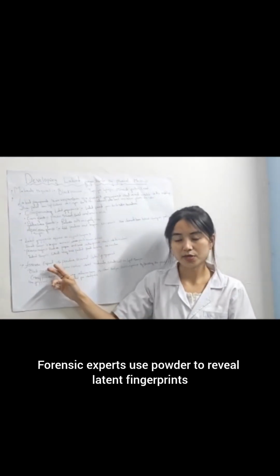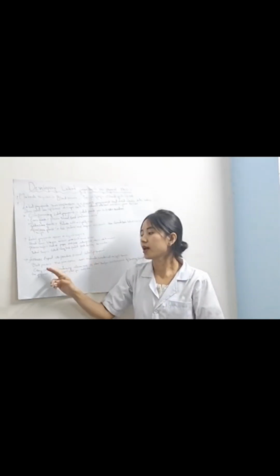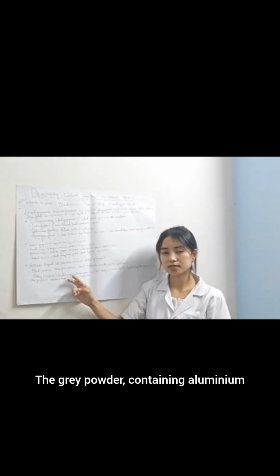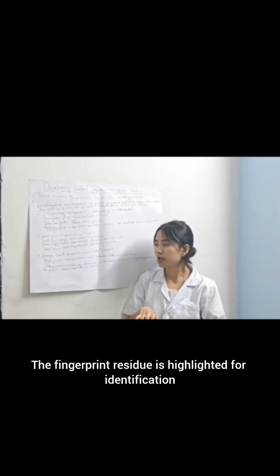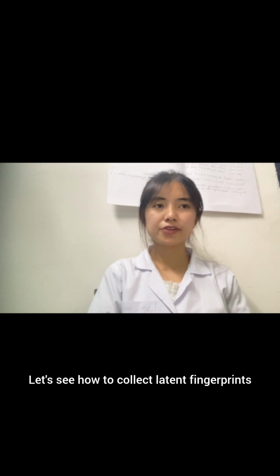And forensic experts use powder to reveal latent fingerprints. Black powders made from carbon-based material work well on light surfaces, and gray powder containing aluminium is best for dark backgrounds. By brushing the powder gently, the fingerprint residue is highlighted for identification. And let's see how to collect latent fingerprints using the powder method.